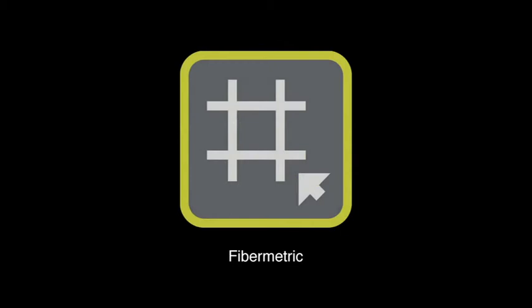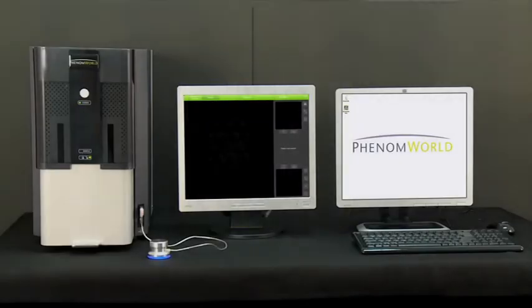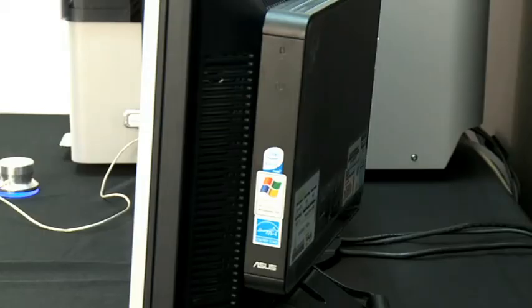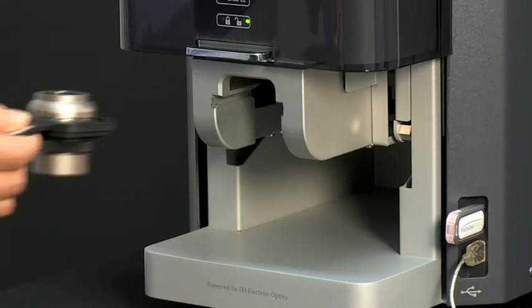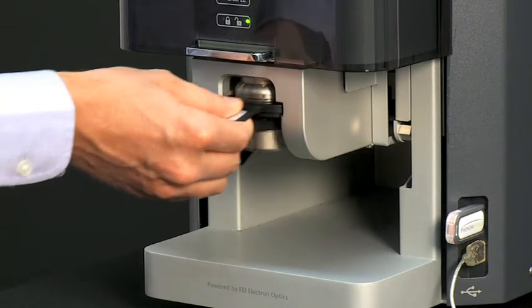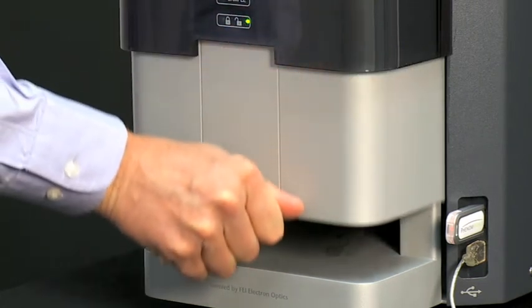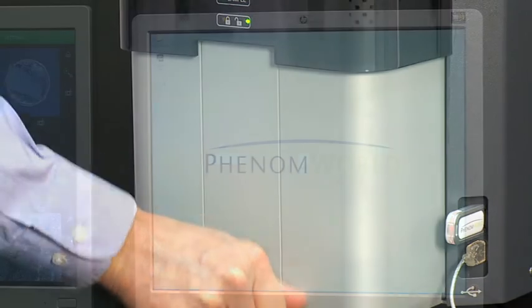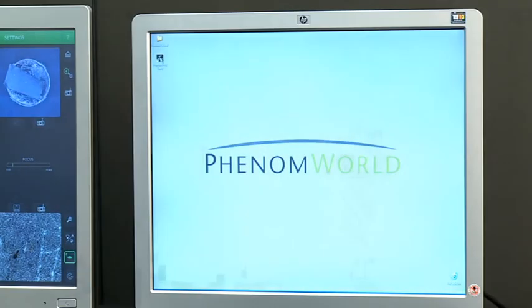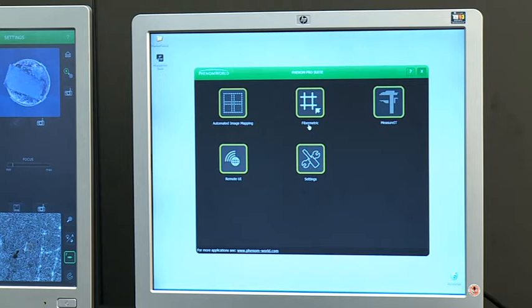Welcome to the PhenomWorld webcast on FiberMetric. The FiberMetric application software starts collecting data as soon as the fiber or filter sample is loaded. The FiberMetric application software can be found under the Phenom ProSuite, which is located on the Phenom application system.